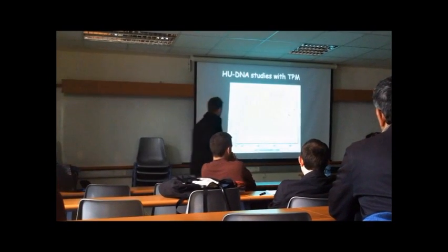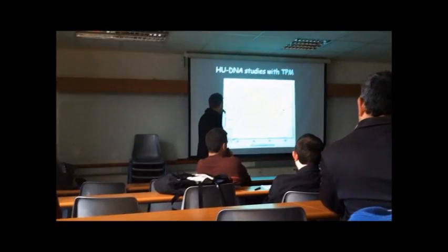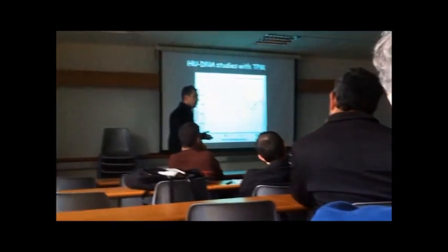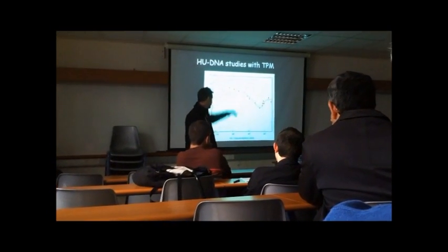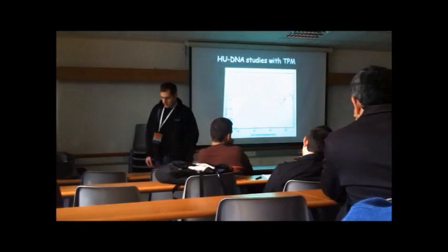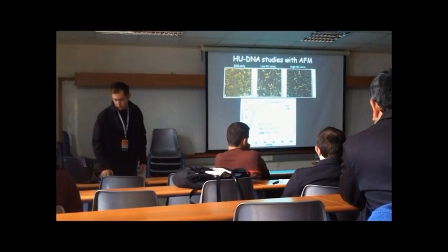Okay, so here's a plot summarizing the dependency of the persistence on the concentration of HU, and you do see the bimodality where at first the persistence is decreased and then it's increased. Not that it was restored, but still increased, and you see the bimodality.